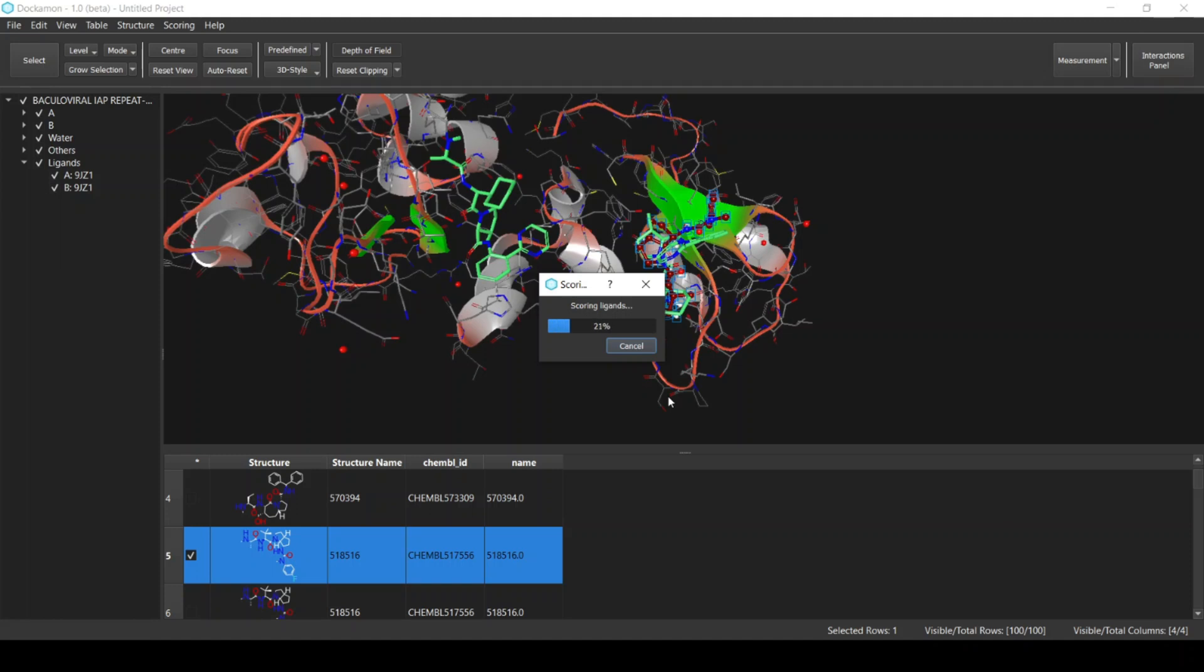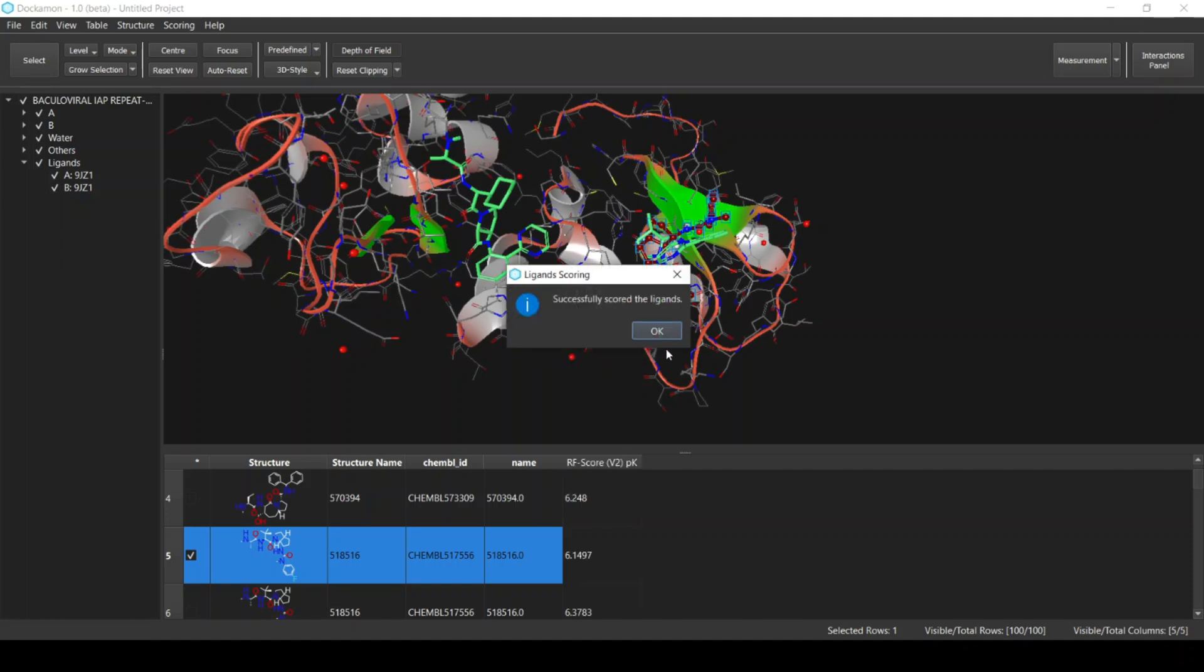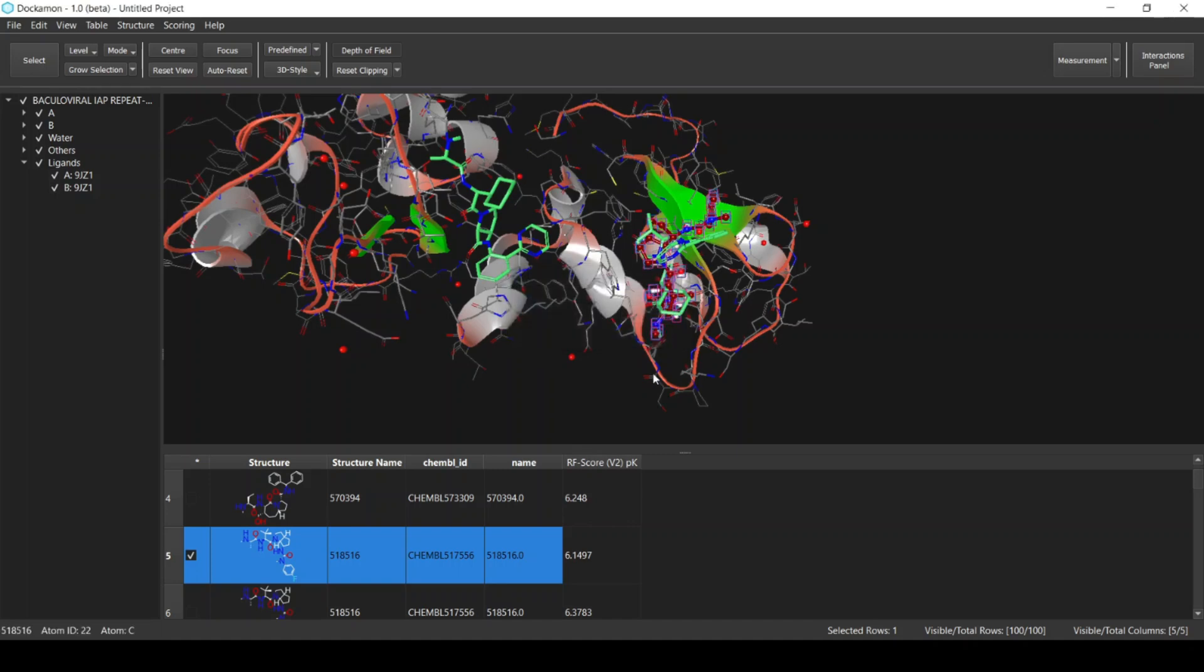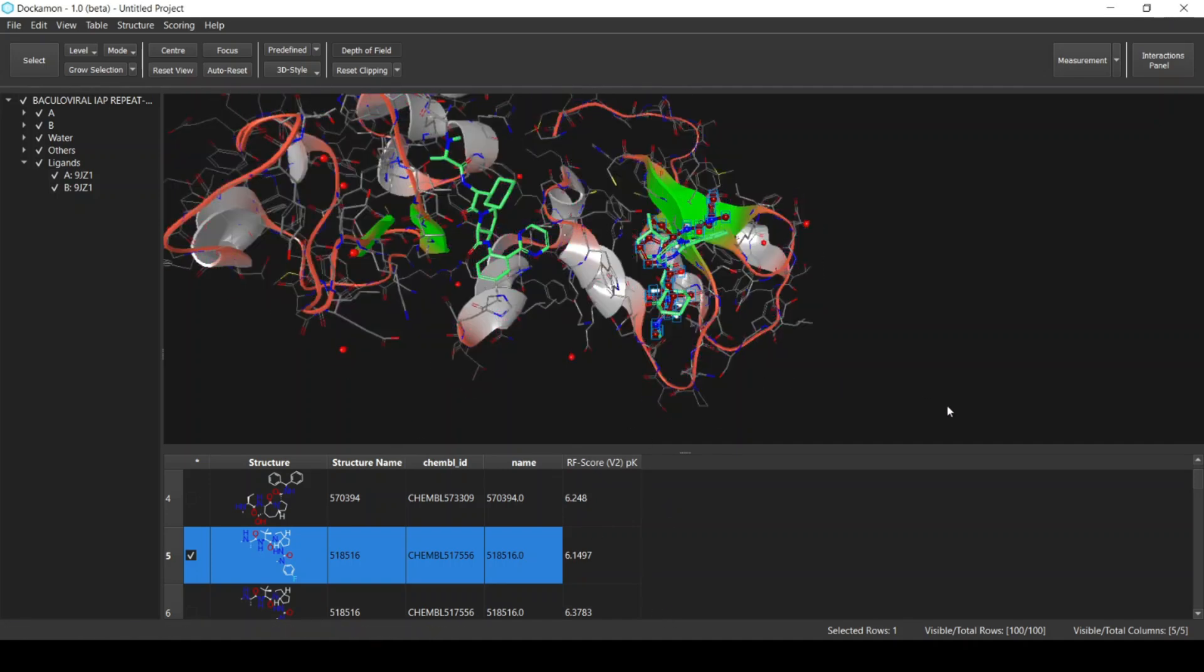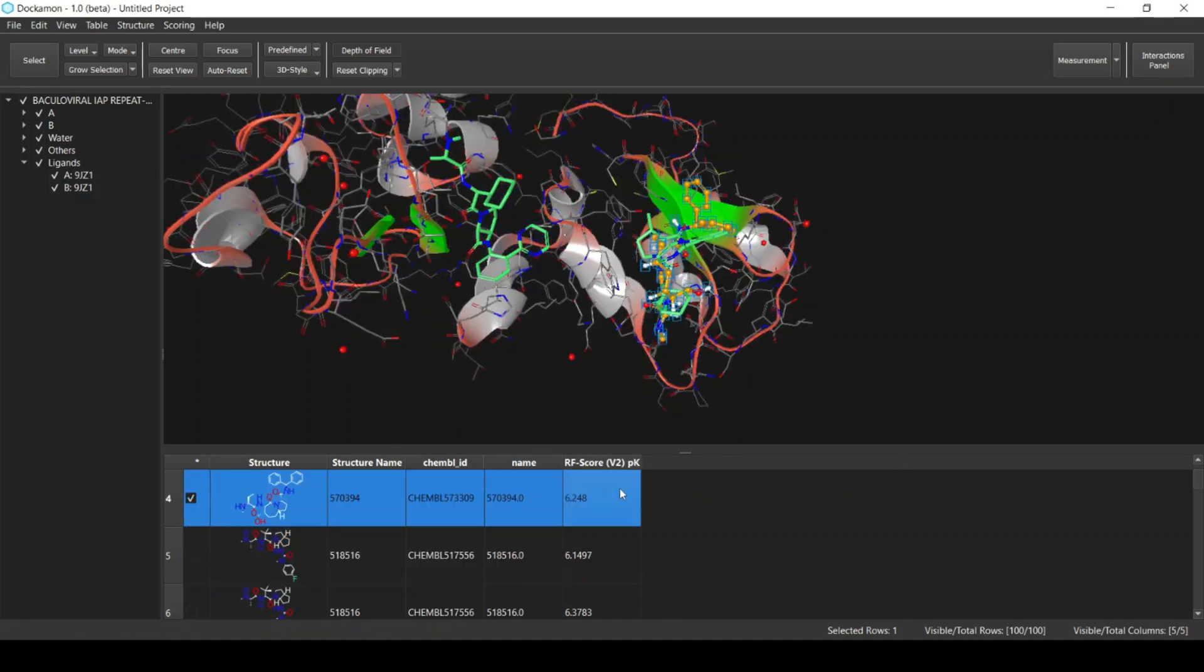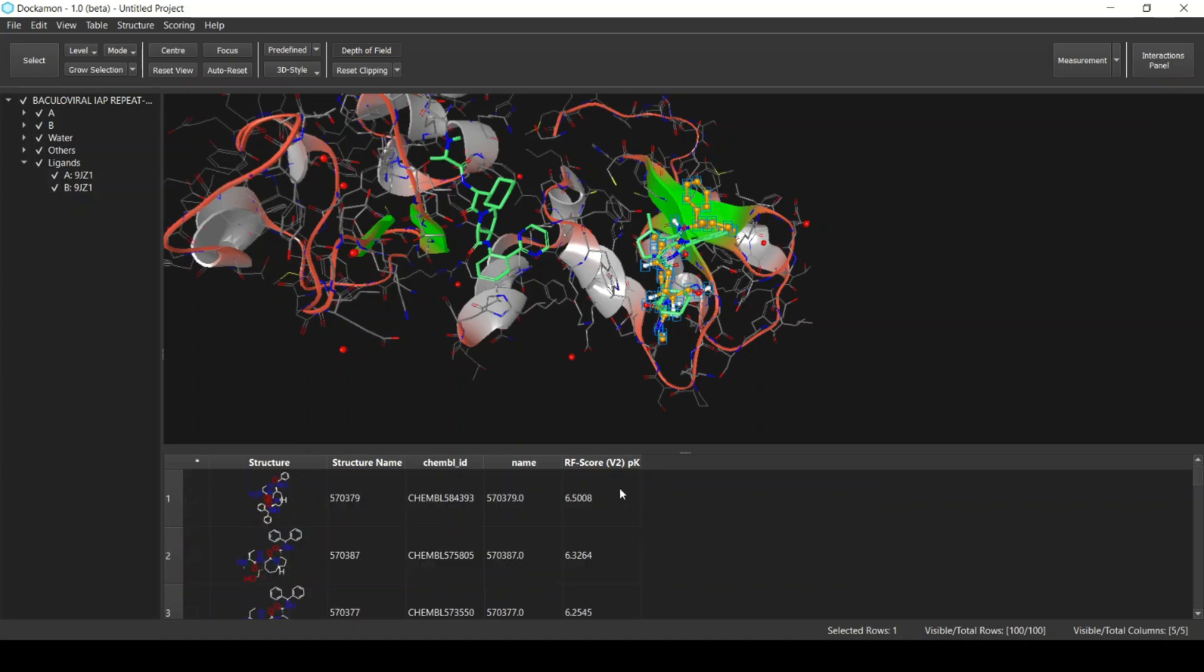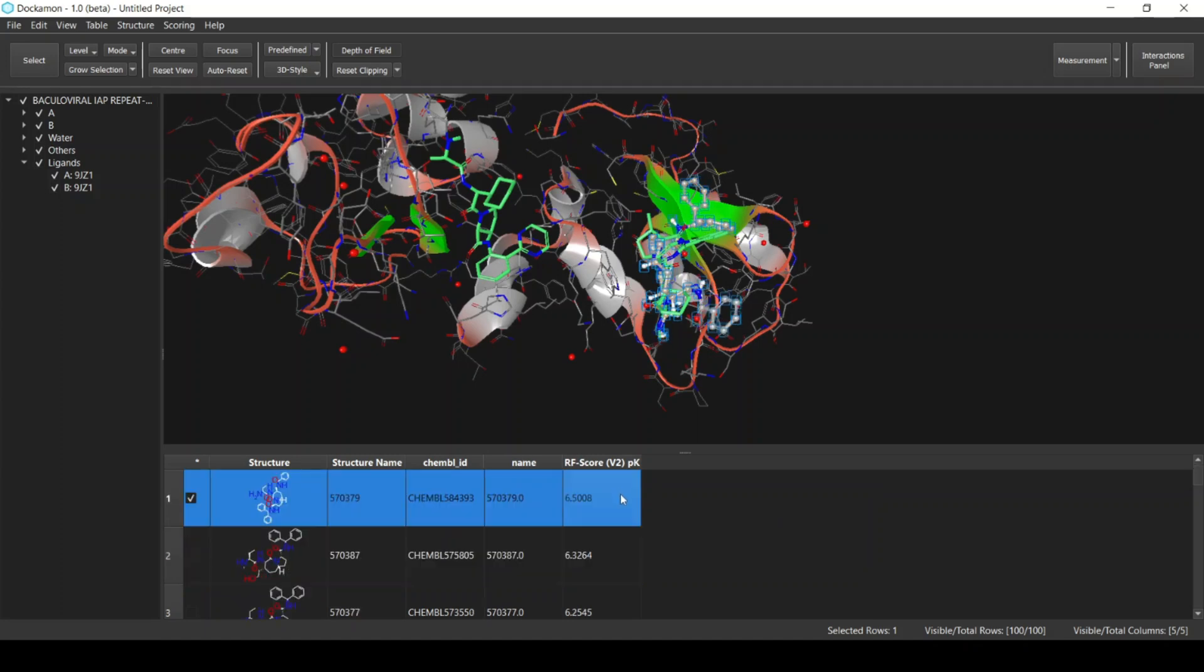The ligands will be scored. The scoring is complete and as we can see here we have this column here called the RF Score PK. Basically this is the results of the scoring. Note that the result is in PK—this is the minus log of the activity—and simply the higher the value, the more active the ligand is predicted to be.